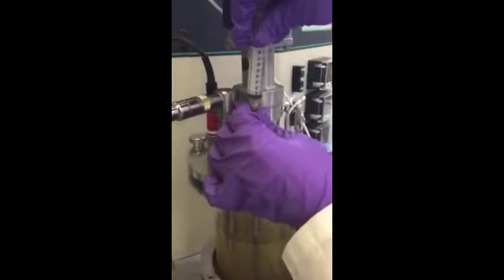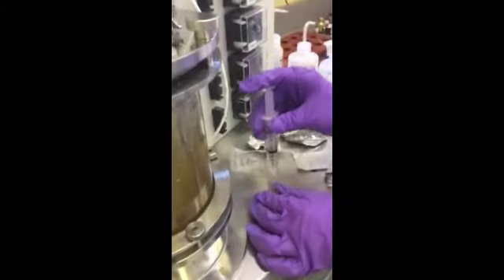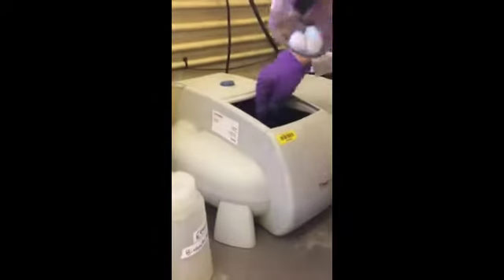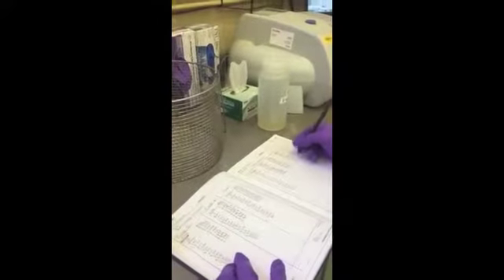Draw out a 1 milliliter sample from the bioreactor using a syringe. Eject the sample into a cuvette. Remember to cover the bioreactor. Put the sample in the spectrophotometer and take a reading. Record the reading in your lab notebook, along with the reading for the pH and DO. Dispose of the sample in the appropriate ethanol waste container.